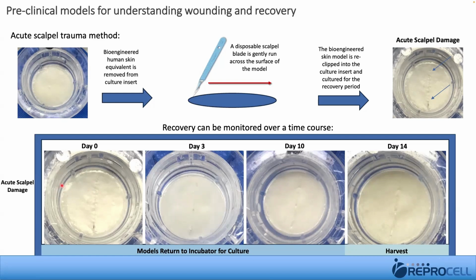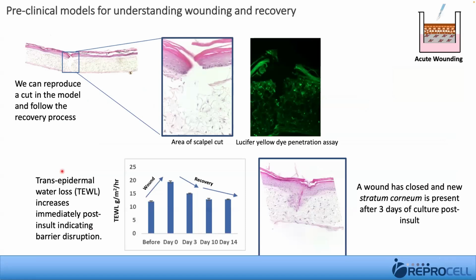We've actually just also acquired the VisioScan technology, which is used in the cosmetics industry, to apply to our models. So we can use that as an output as well. So these are the scratches you see on the skin. They're superficial. You can see that very nicely.